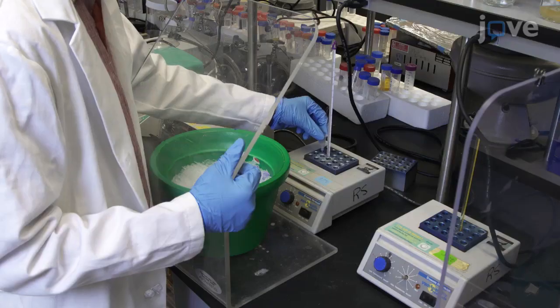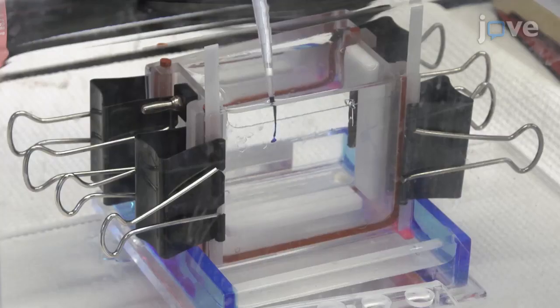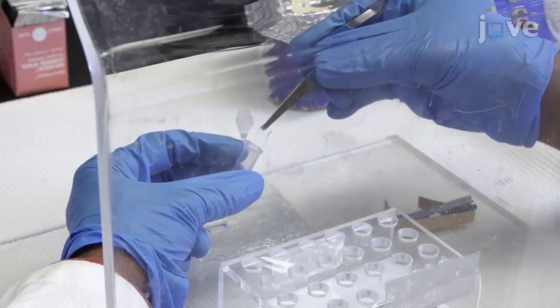The protocol is used for saturation mutagenesis of a protein binding site. If a protein binding site is not known, it can be identified using this protocol. The technique has relevance for disease diagnosis and therapy. I believe its full potential in biomedical sciences remains to be fully exploited.